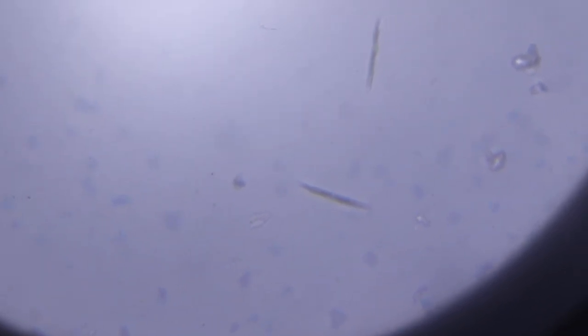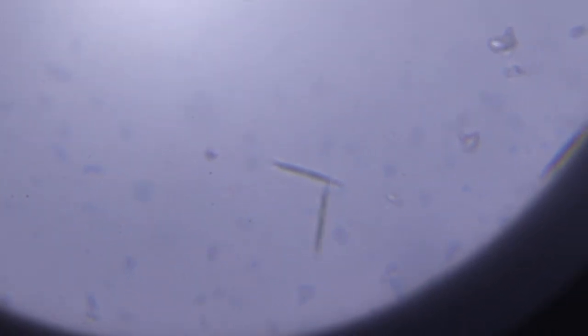So I'm looking here and I see a few pieces of algae, but they're pretty small. And I'm not able to magnify them any greater because I'm on the highest level of magnification without using oil. This is exciting, there's some little creature. Oh, it's going out of the field of view. There, that is moving through the water, you see that. I'm not sure what that little guy is. There's another one.